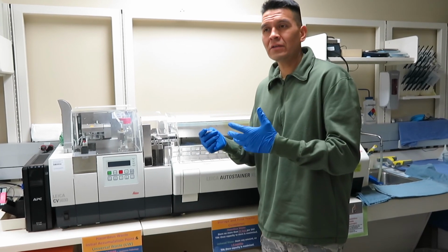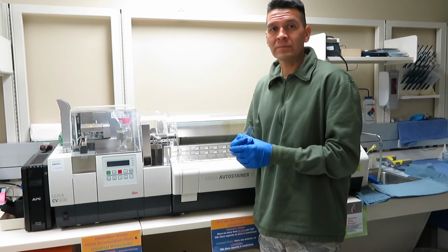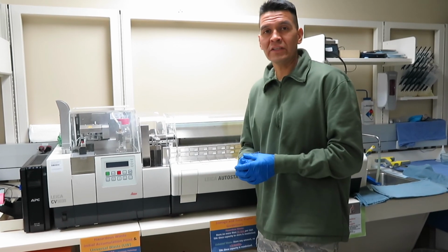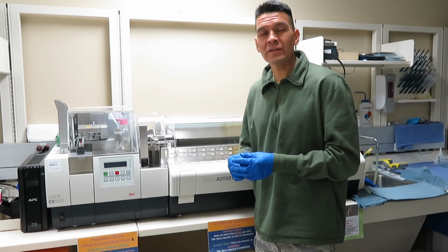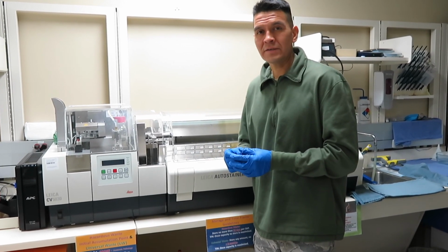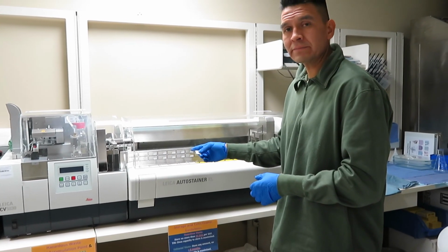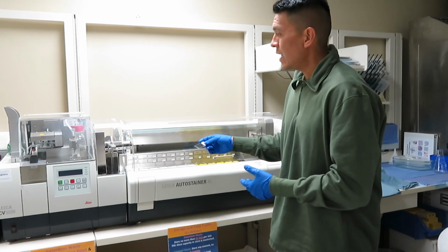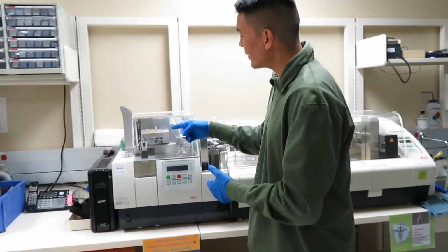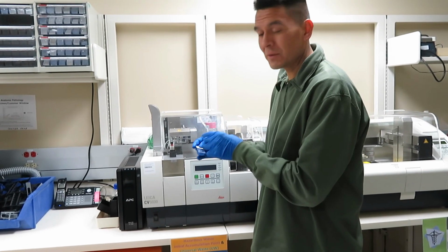So then in general, the nucleus is a little darker than the rest of the cytoplasm, and also the surrounding tissue, what we call the stromal tissue or the connective tissue that holds the cell in place. So it'll go through this over a certain time period, maybe half an hour to an hour, and then it'll plop out here, and then this automated machine has a cover slipper.